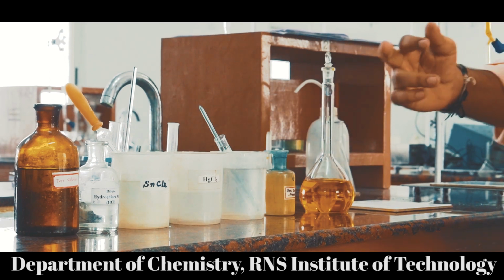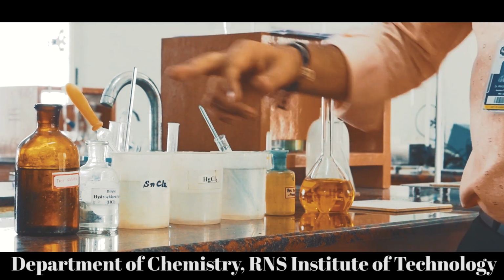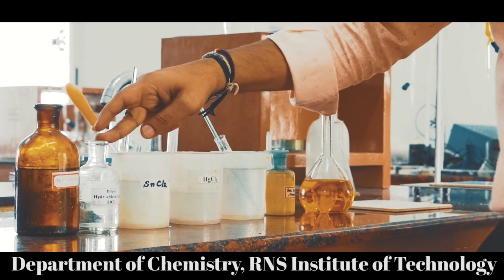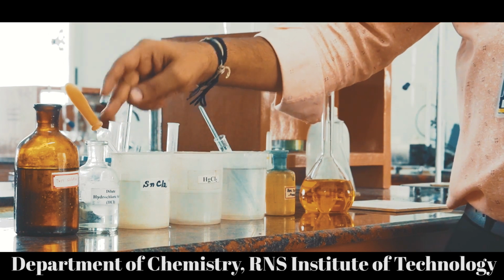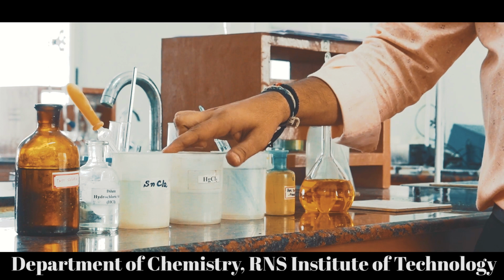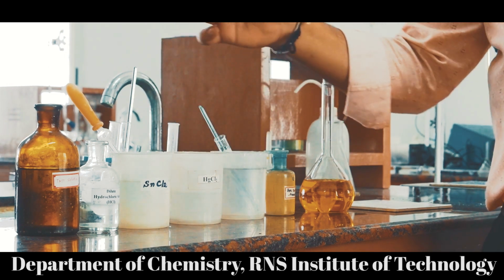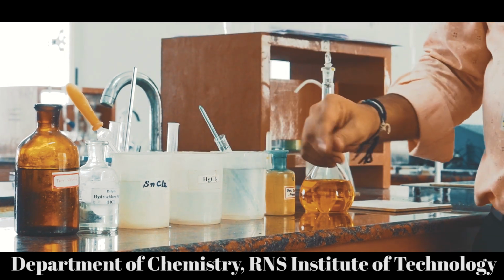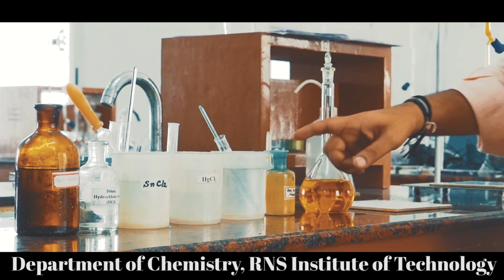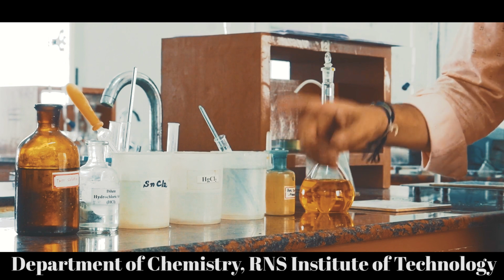So the chemicals which are required to do titration are: one is TMT bar solution, the other one is dilute HCl, that is hydrochloric acid, we need to add 1/3 test tube, and this is stannous chloride, a strong reducing agent, we need to add this dropwise into the reaction mixture in hot condition, and then we want mercury chloride in order to destroy excess stannous chloride.